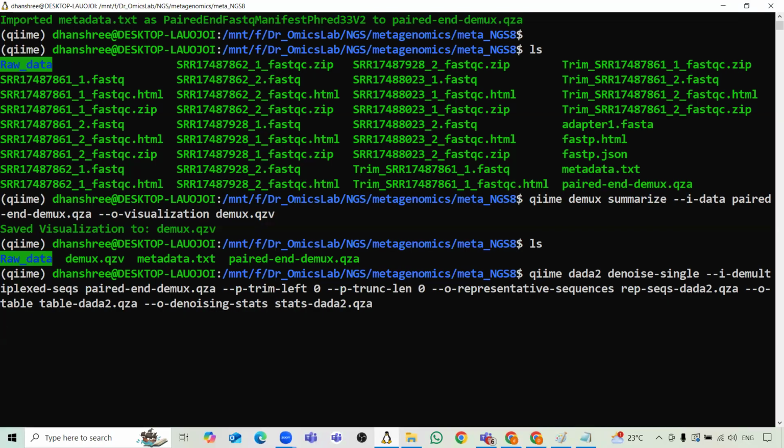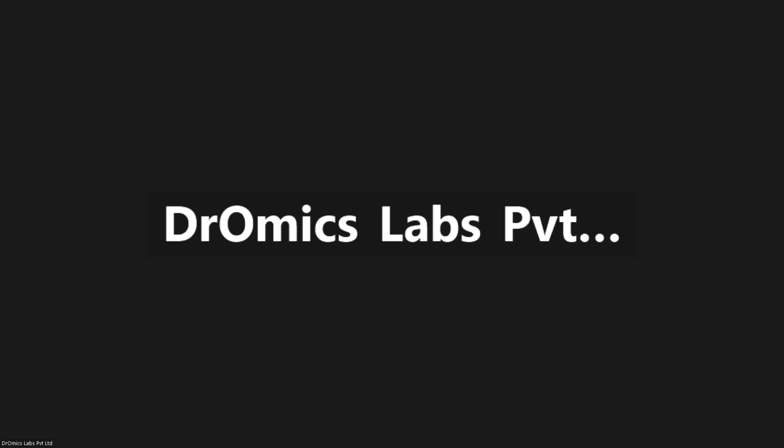So, is there any doubt to you? Because this command will not generate within our session. It will take time. So if you have any doubt, you can ask me. Otherwise, you can disconnect.